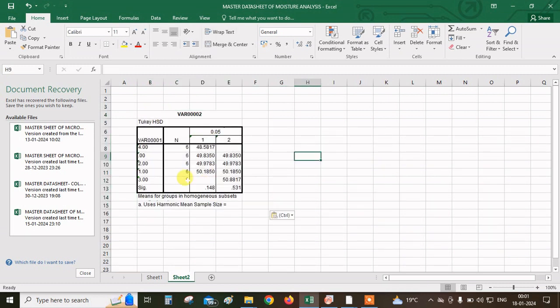So now we already know that this is our table, right? So what we will do, these are actually what? These are the means of those samples, right? So in order to have the statistical analysis, we will consider this group as A and this group as B. Okay. Now, first of all, before I go to assign the statistical analysis symbols in the graph, I need to explain to you why we need one-way ANOVA and the post-hoc Tukey test.